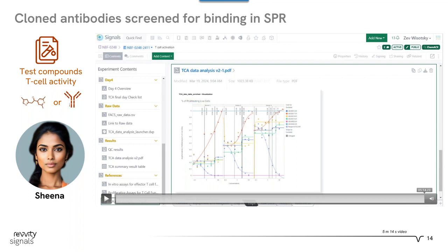So we can either talk about the assay, how well it's doing, or we can talk about the data itself. Hey, this candidate is showing really great activation for our cancer profile, or this candidate is showing really great inhibition for some immunology target that we're after. Or hey, we don't expect to see any activation or inhibition, and the drug candidate screens that we're doing are not showing those. So that's at least a good check for us from a safety or efficacy standpoint.